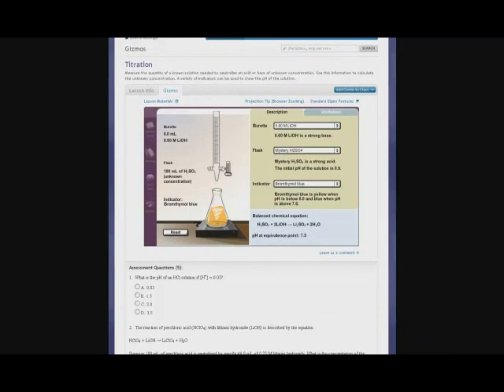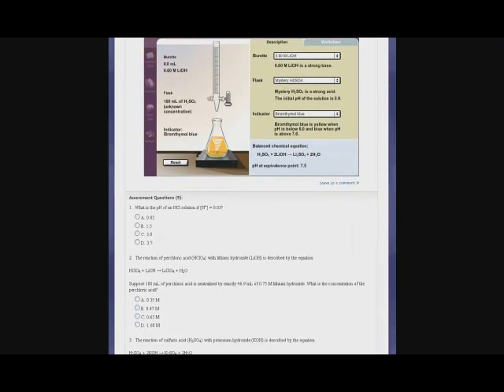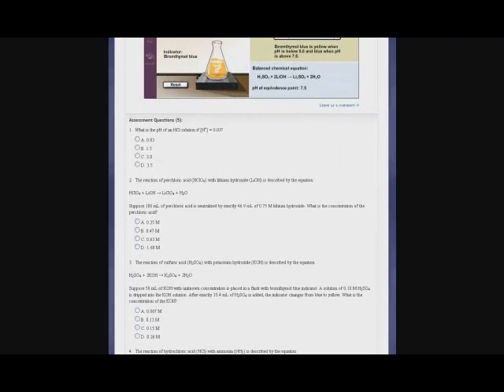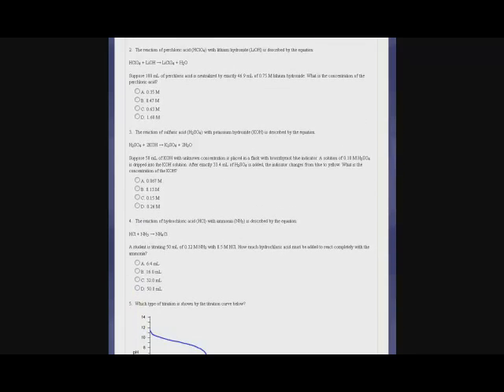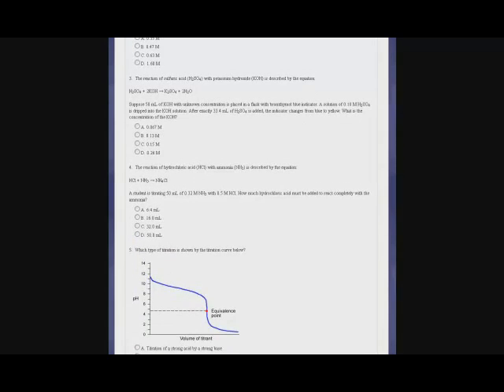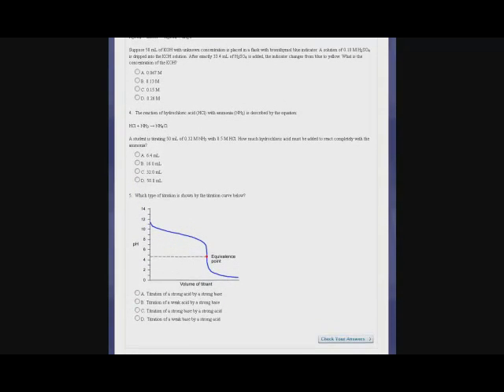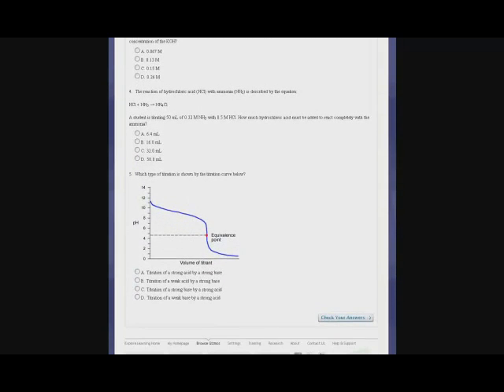This gizmo also comes with five assessment questions. These questions do not change, they're always the same. When you have answered the five questions, you can check your answers and you're automatically graded and you'll be given feedback for any incorrect responses.